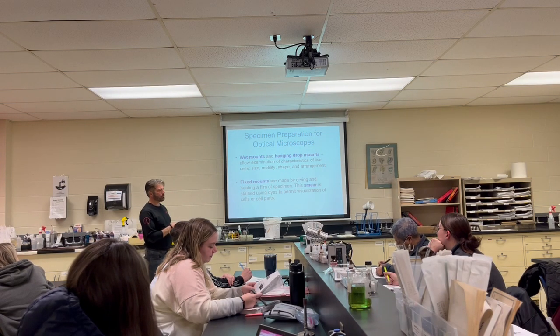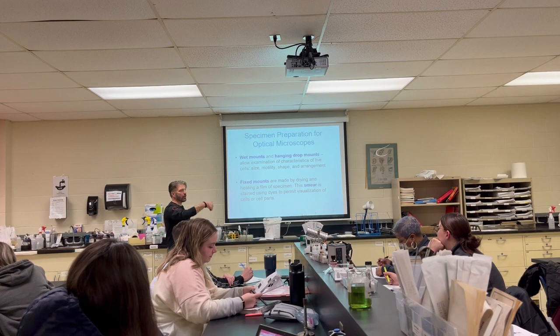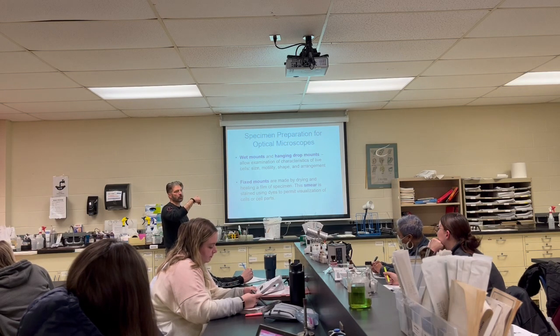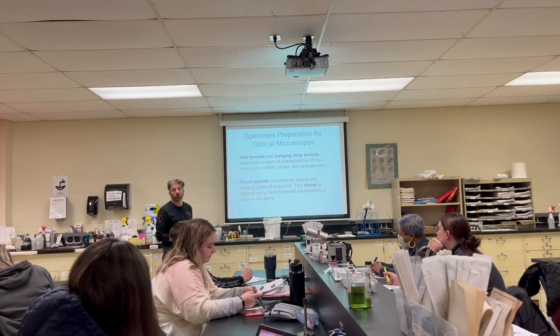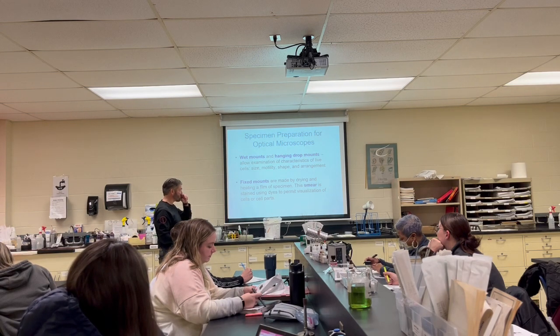We can put a drop of water on a slide with a well, turn it upside down, let it hang there, and you can look at it if you want to see something moving. If you want to do that, we can do that. Or bring in pond water, or something from your aquarium. You can definitely do that if you want.